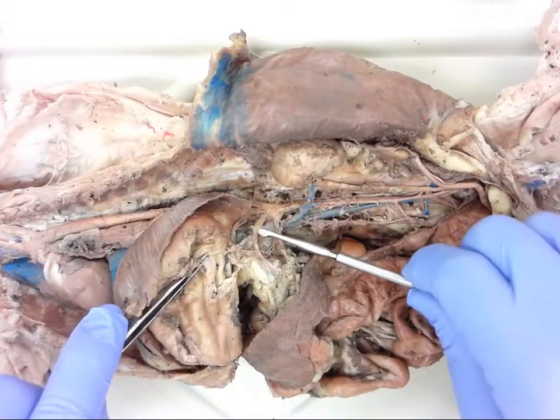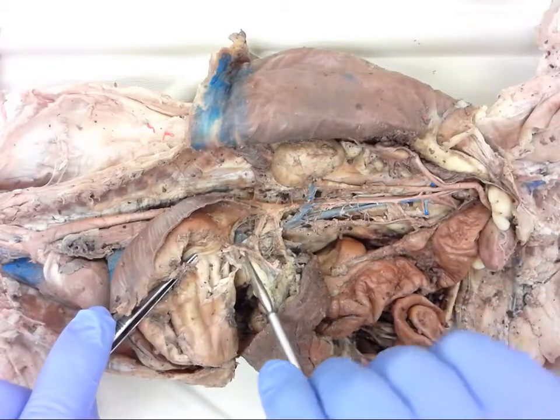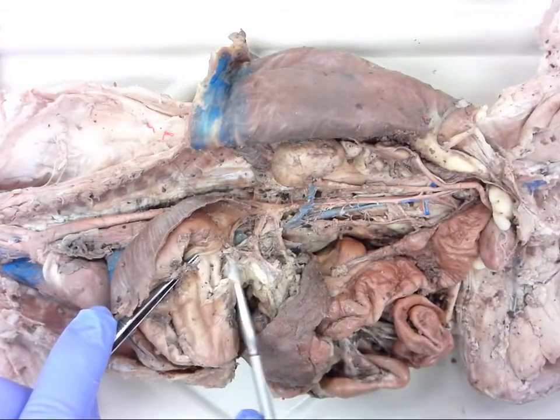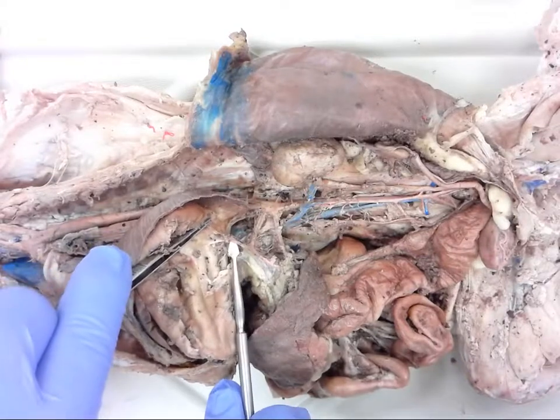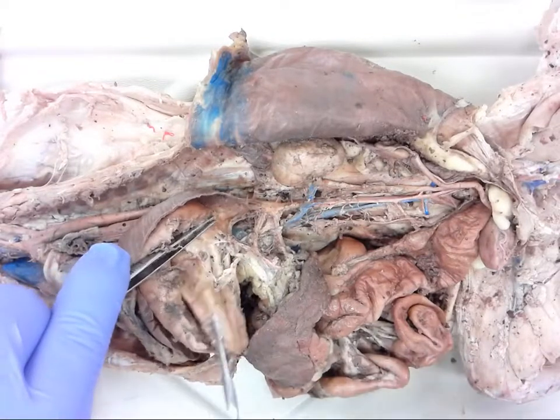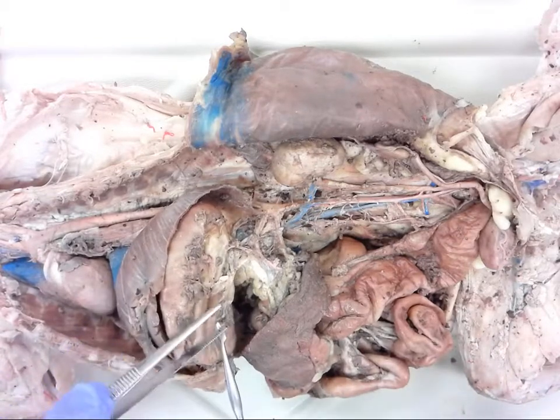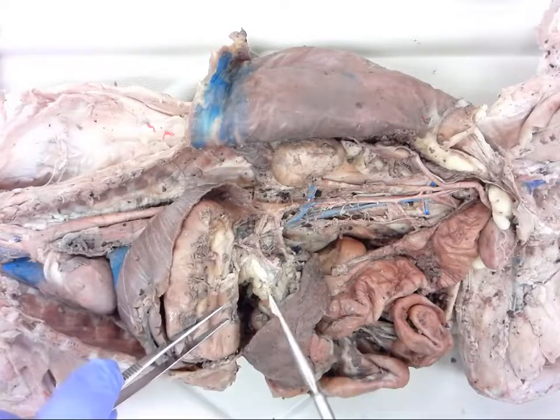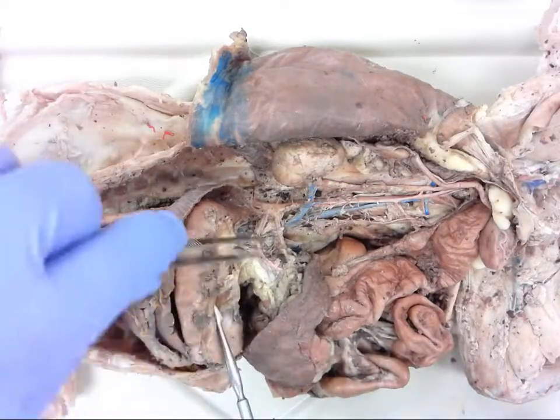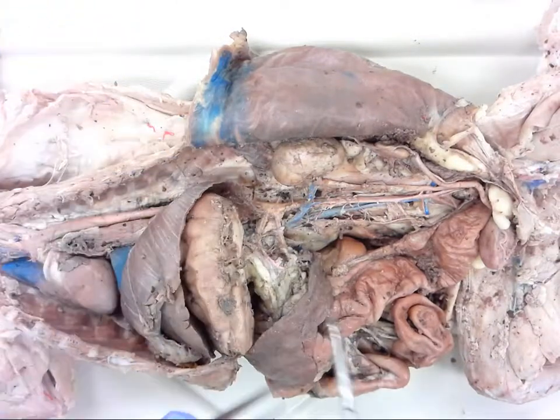Your celiac trunk is actually going to split a couple of different ways. It is going to go off, you can see right here, if I can pull it out a little bit better. This is your gastric artery, and it goes right off to the stomach. Deeper in there, which is not easily identifiable, is the hepatic artery that goes to the liver. And then you also have the splenic artery, which goes off to the spleen. You can see that right here, heading out here to the spleen.